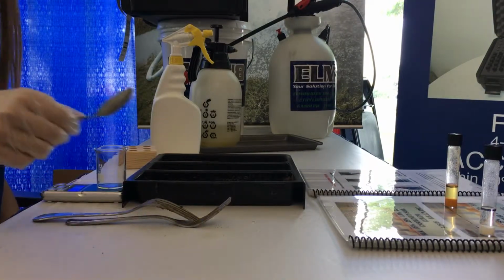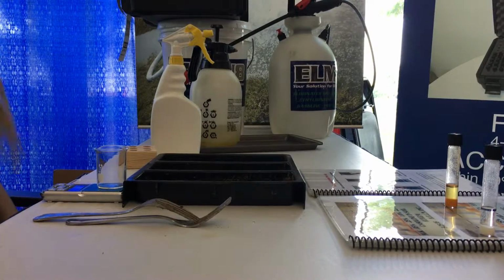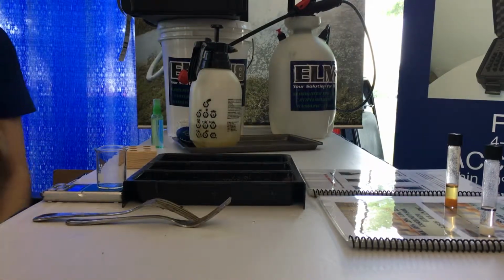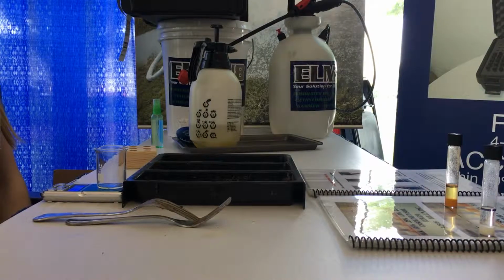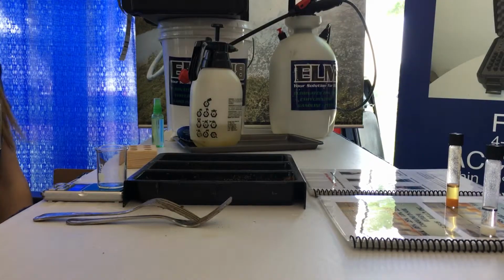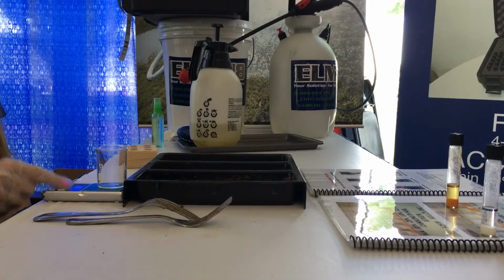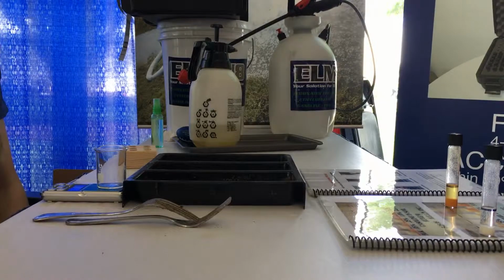So going back to our normal process of doing a soil analysis. Clean that spoon. Grab me another spoon. It's contaminated. So we're going to do our normal process of doing our soil sample. We measure out our 5 grams of soil. Now it's 5 grams of mud. I don't want to contaminate my stuff. Put it down. There we go.